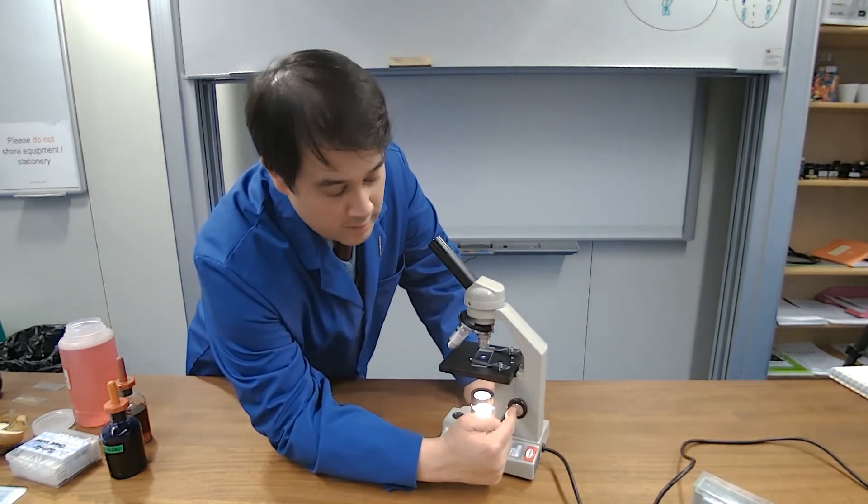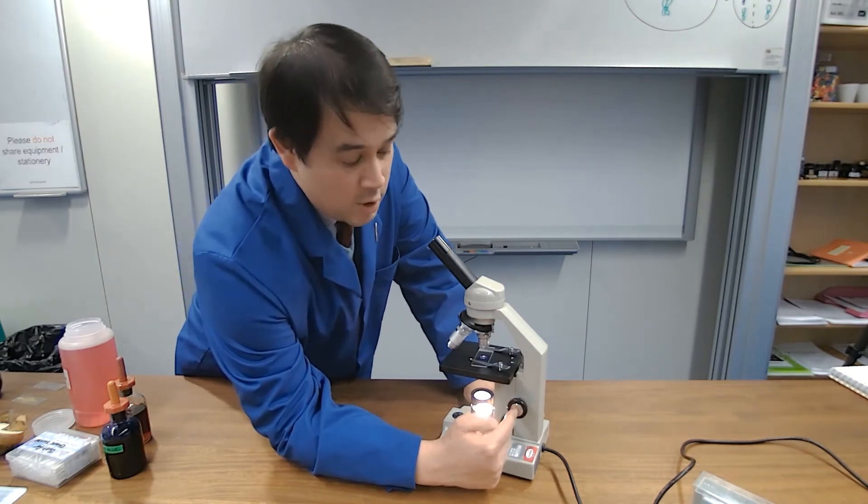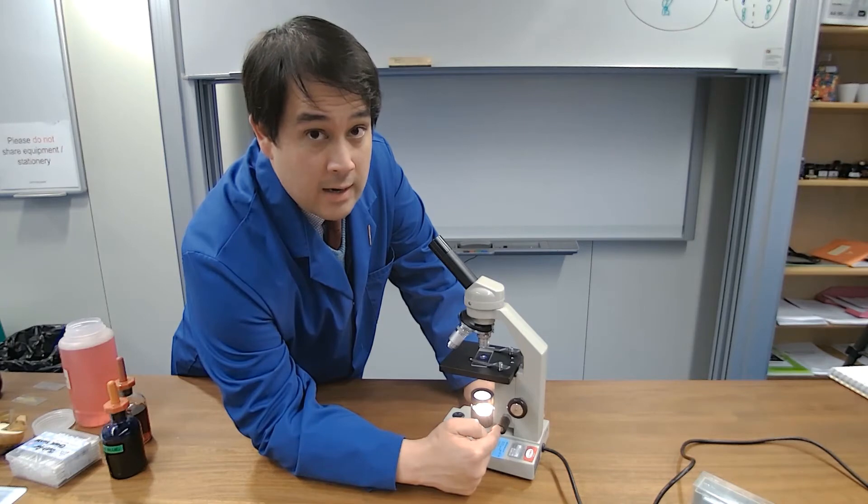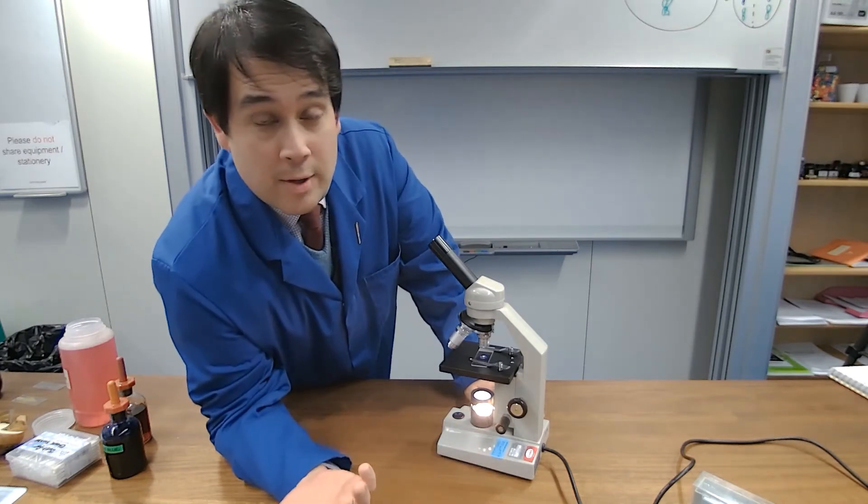We do that by lowering using the coarse adjustment knob and then once we start to see an image we then use the fine adjustment knob to get a nice focus on there. Once that is done you can then draw your image and have a look.